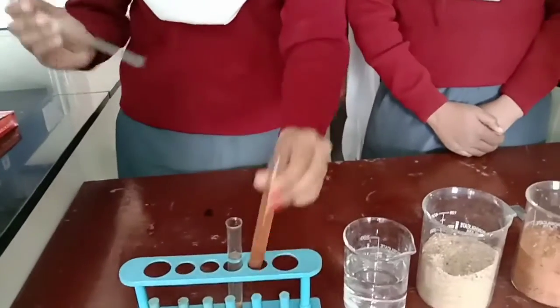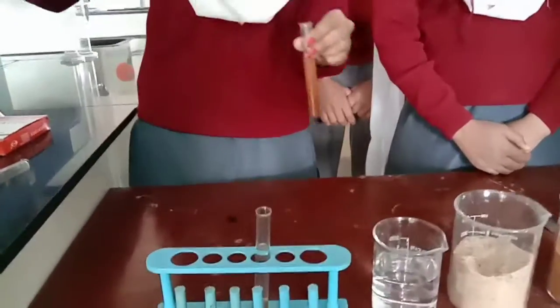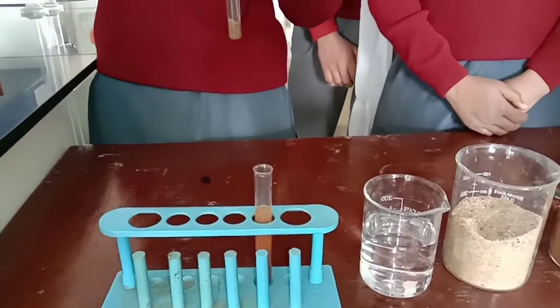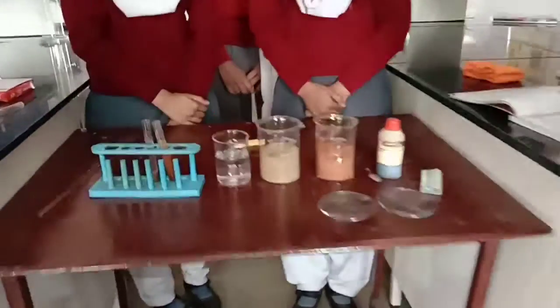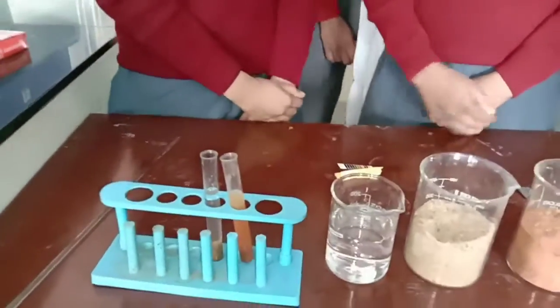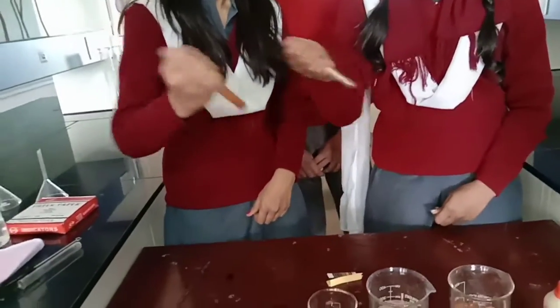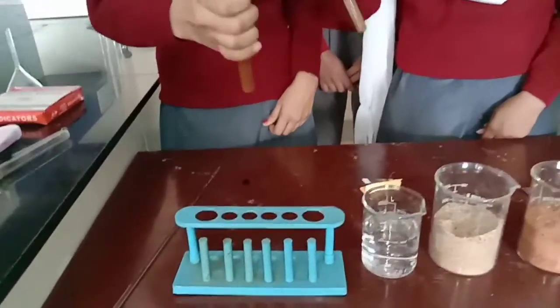Now we have to mix the content thoroughly with the help of a glass rod. This is optional. You can use the glass rod, or we can directly shake the test tube so that the content inside is mixed well and thoroughly.